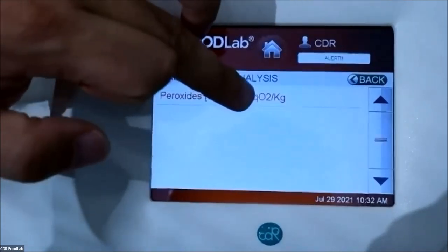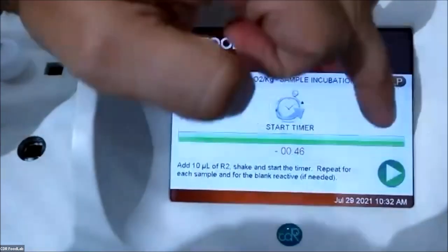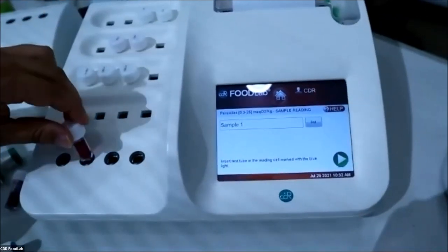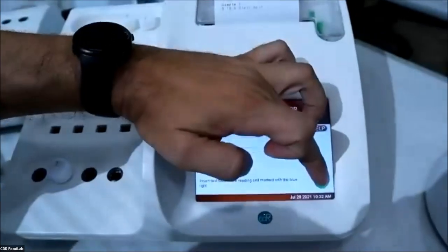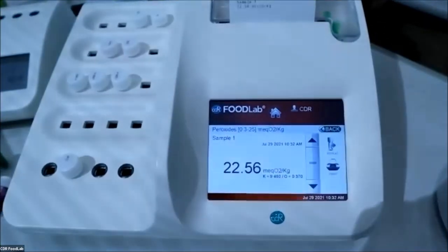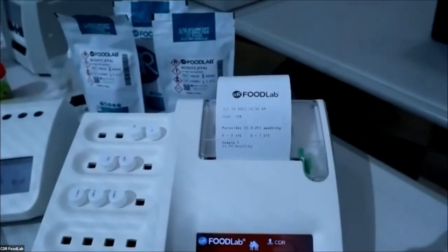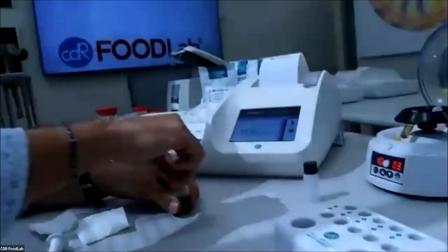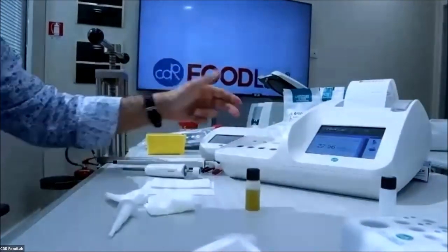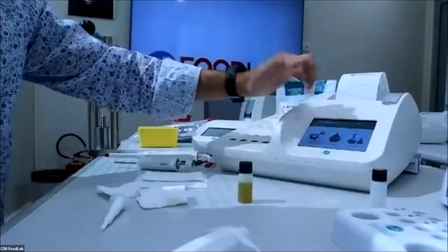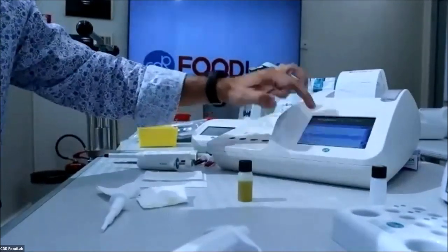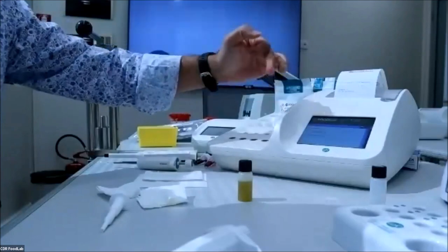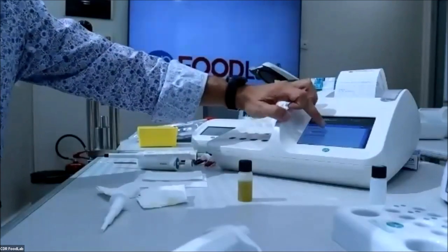There has been a decoloration of the reagent — this decoloration is correlated to the free fatty acid content. The result for free fatty acid is 0.18% in oleic acid — we can also express it in lauric acid, no problem. The peroxides incubation is now over, shown in red on screen. We take the cuvette, put it into the reading cell, and press read — we have the peroxide result: 32 milliequivalents per kilogram. Not a good oil. For the anisidine, we press back, select anisidine, select oils and fats. We have different calibration cards — there is specific calibration for fish oil, for example. We select anisidine and change the pipette volume to 20 microliters.